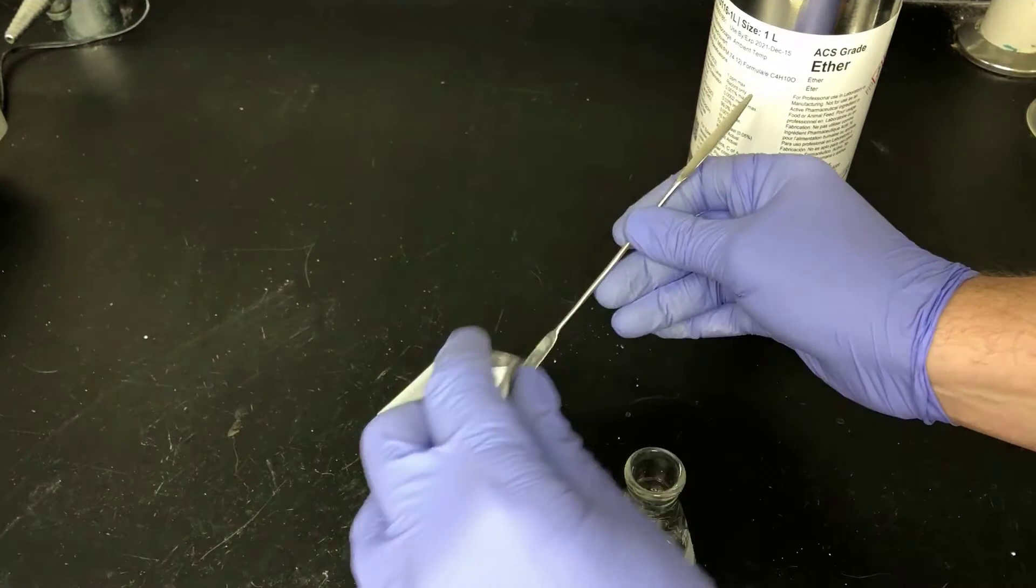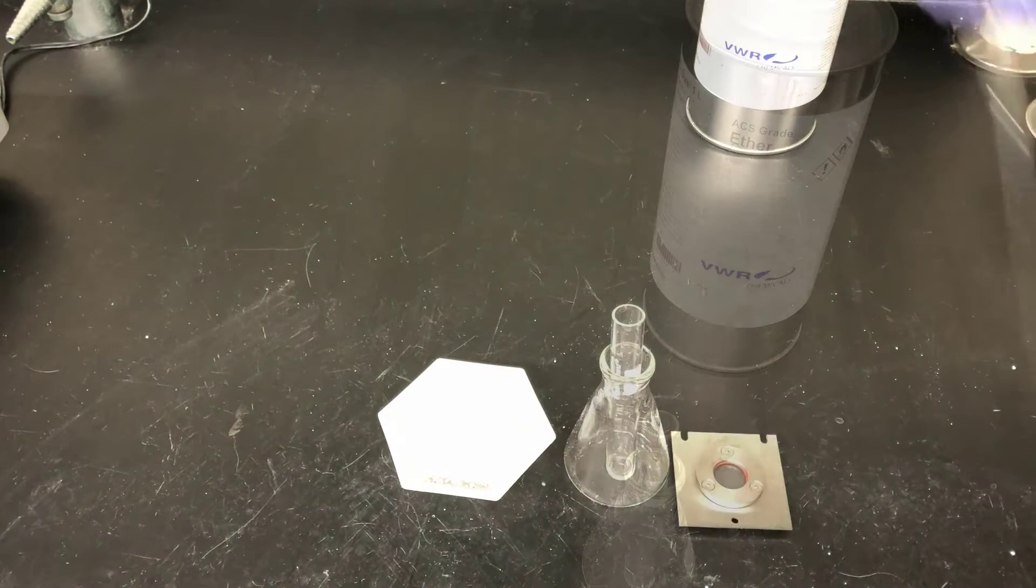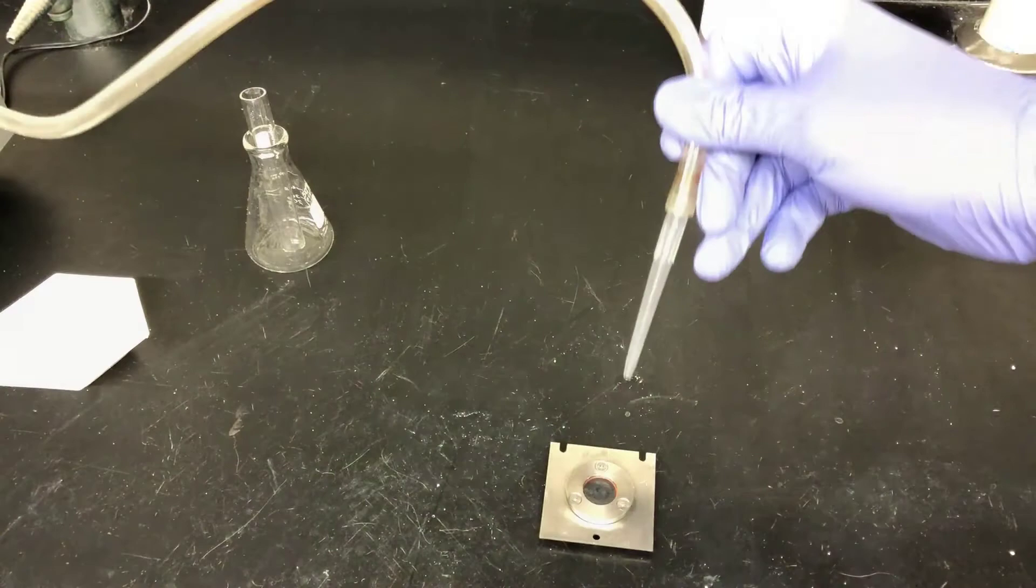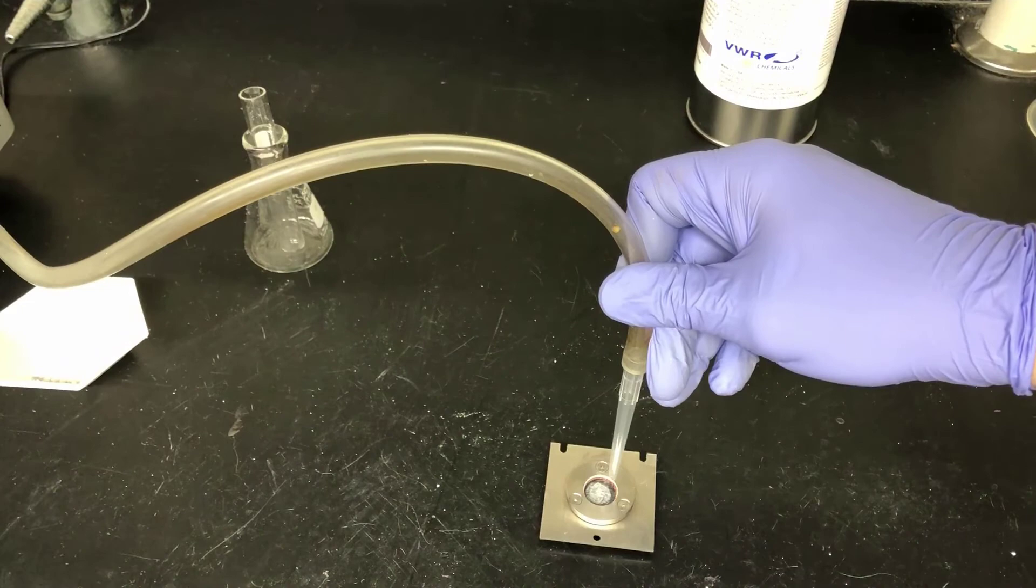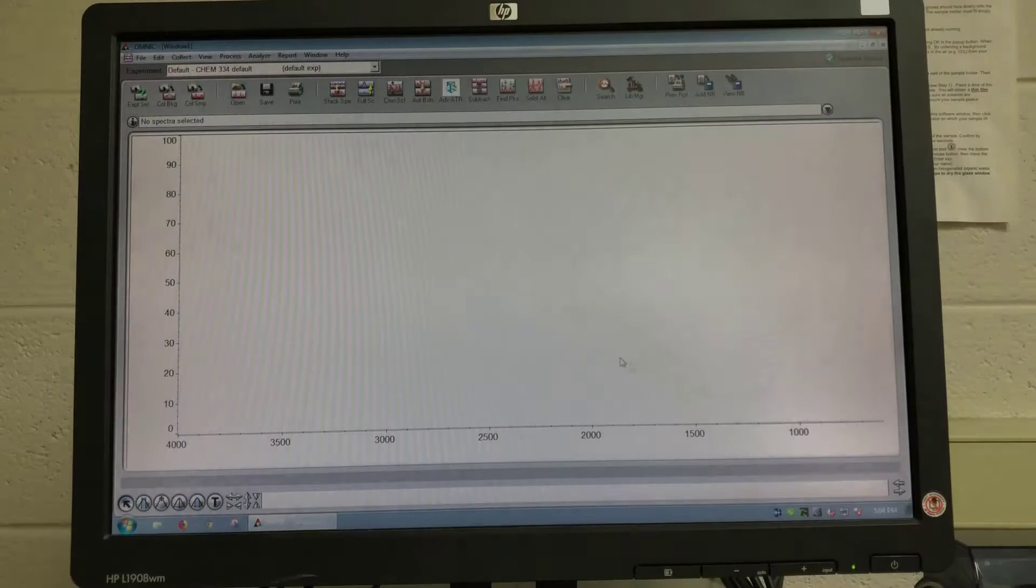Finally, I'm preparing a sample for infrared spectroscopy IR analysis here. I'm taking a little bit of solid and putting it in a test tube, and then I'll add a little bit of ether to make a solution. Now I'm pipetting that solution into a well on an ATR crystal plate. And I'll evaporate the ether solvent using a gentle stream of air. This leaves a white residue of benzoic acid in close contact with the crystal plate, which will give a good IR spectrum. Now I'm placing the crystal plate on the IR spectrometer on the ATR accessory. Then I'll go to the OMNIC software and hit collect sample, and the collection starts. Here's a high resolution IR spectrum of benzoic acid that you can use in your lab assignment.